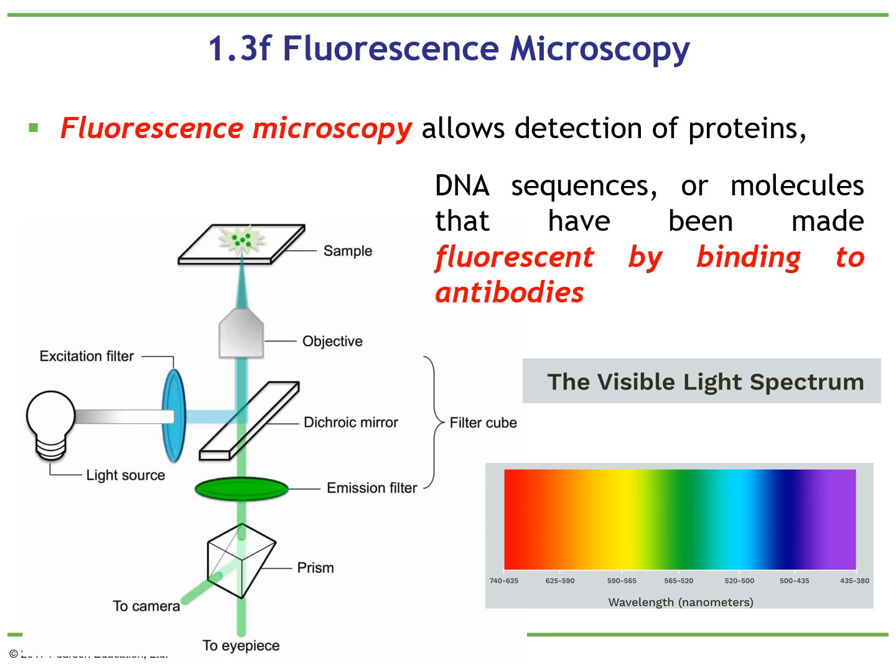Generally, when you go to the microscopes in the lab, when we are going to use the fluorescent microscope, for example, we are going to use the legs of the flies, you will find it first with the transmitted light, with the light microscopy, then you can see it, and you can turn on the fluorescence to see how they fluoresce. Okay, so those both work at the same time.